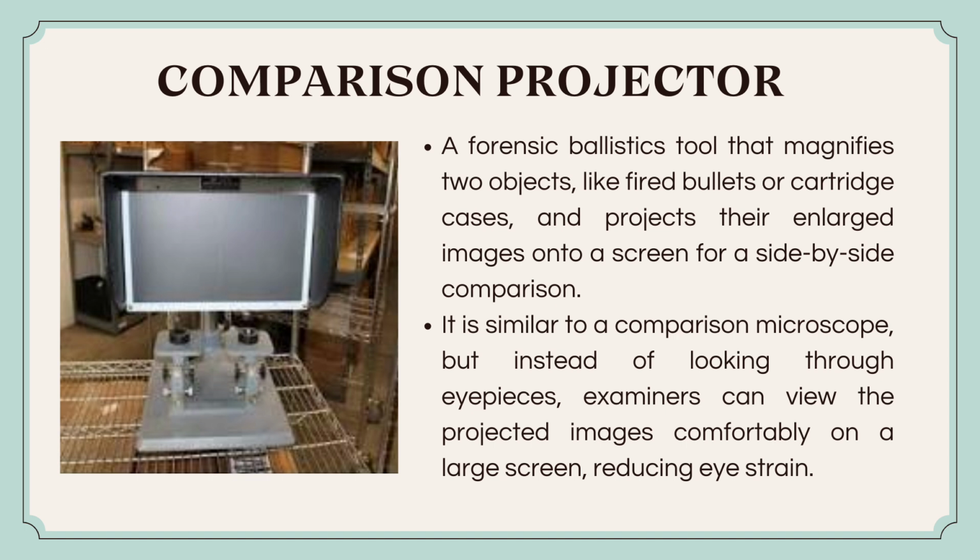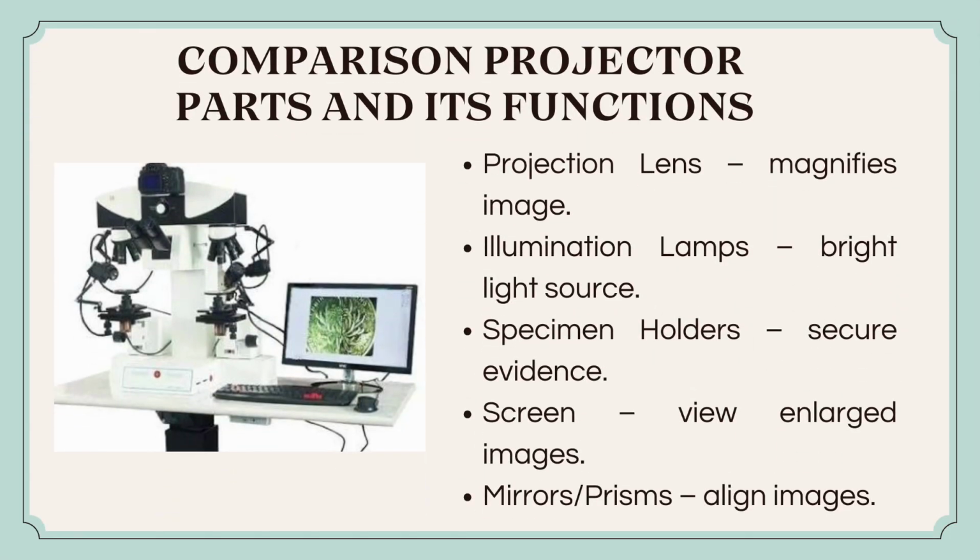This process allows examiners to visually match unique microscopic marks, like the striations from a barrel's rifling or firing pin impressions, to determine if both items were fired from the same specific firearm, providing crucial evidence in criminal investigations. Comparison projector parts and its functions.